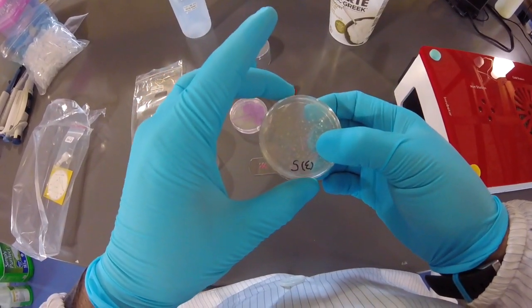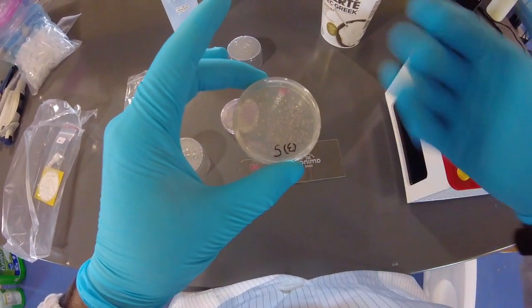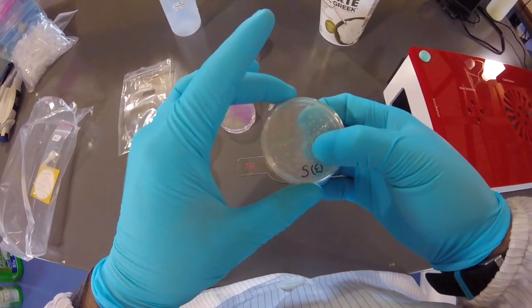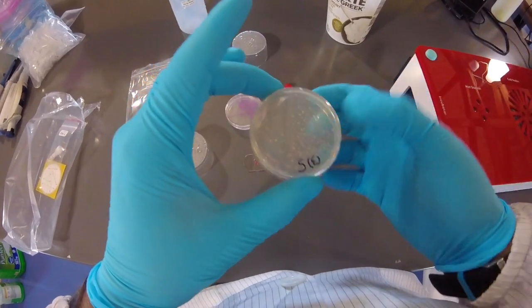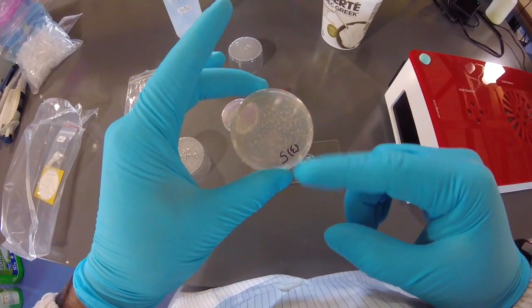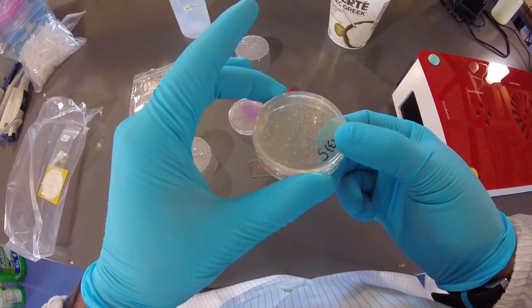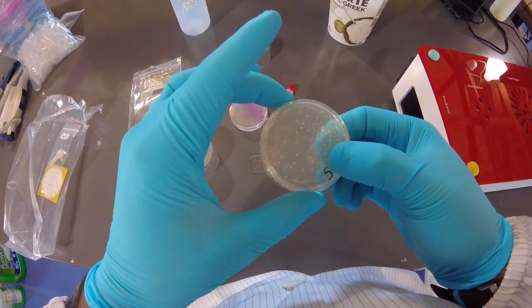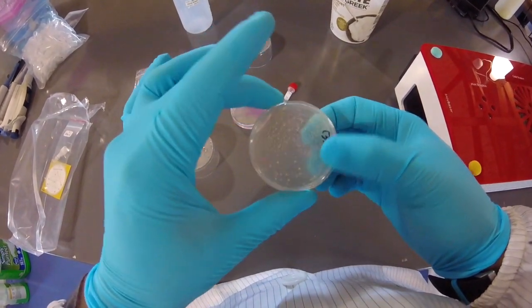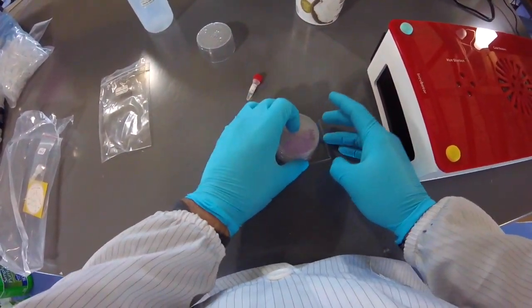As I mentioned before, it typically takes 24 to 48 hours to really start to see the colors emerge. We can already see that there are some colors here, so that's exciting, but we're definitely going to keep this incubating for another 24 hours or so because these colors are only going to get more prominent, okay? I'll talk a little more about why we have different colors here tomorrow. I'll tell you more about the DNA plasmid, or the DNA, that we used on the second day, okay? So I'm just going to put these upside down and put the chamber on.